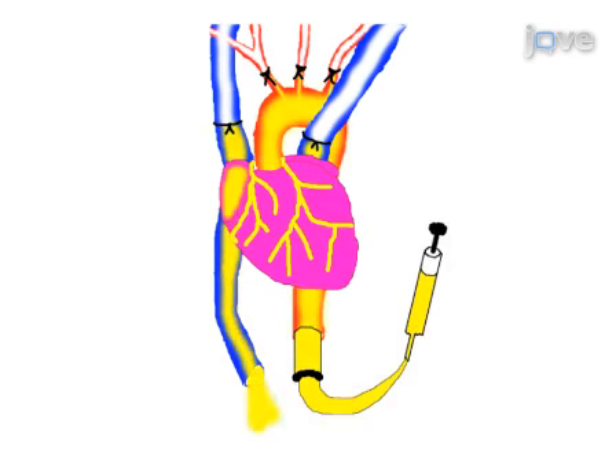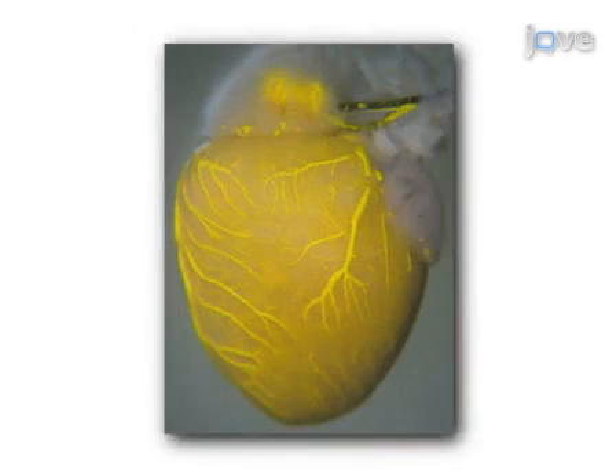Finally, the coronaries are filled with radiopaque dye. The complete filling of the coronary vasculature can be evaluated by visual analysis of the heart or via micro-CT imaging and analysis.